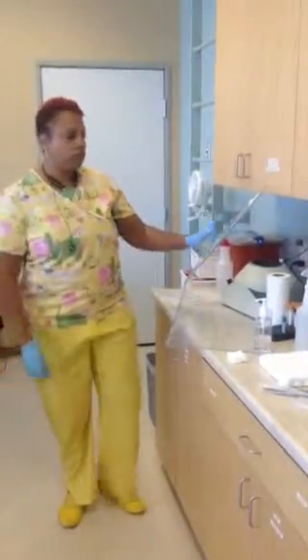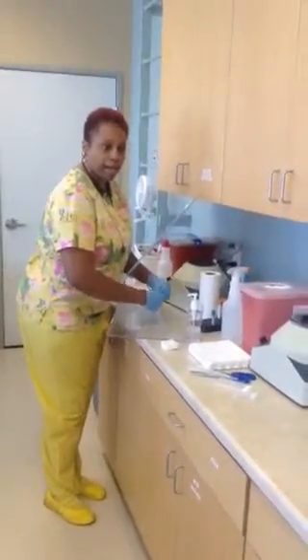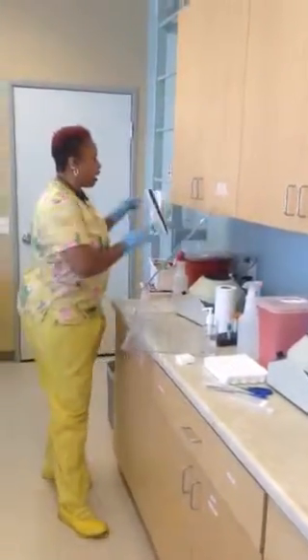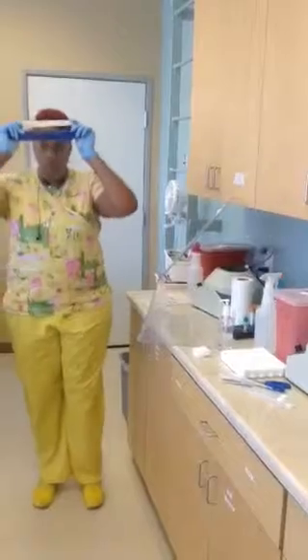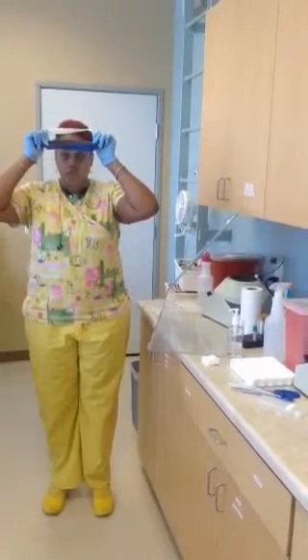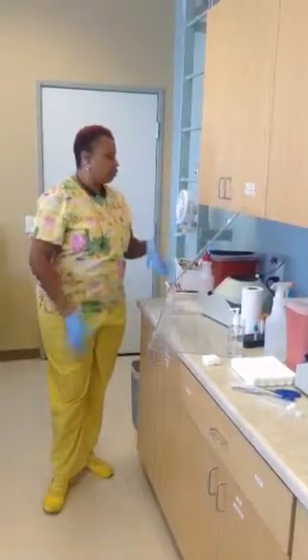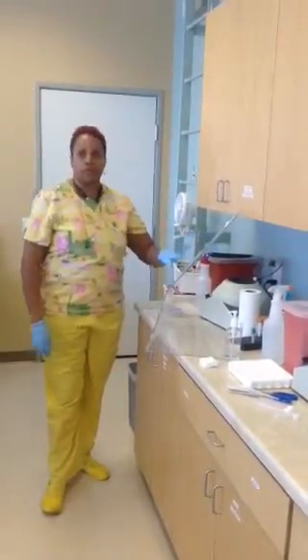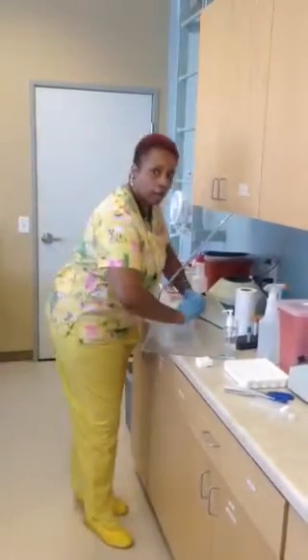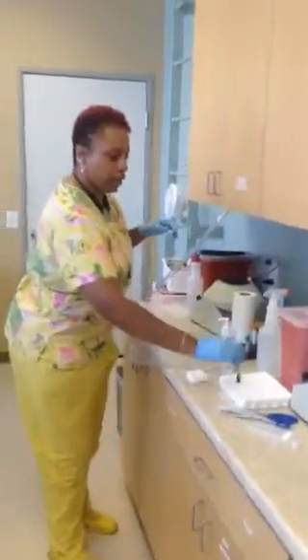Shield — work behind the shield so that you don't get splashed, or put on the actual face guard so that you don't get splashed. Either one. Most times people tend not to want to wear the face guard; they'd rather work behind the shield. Either way will be fine. You just want to prevent splashback.